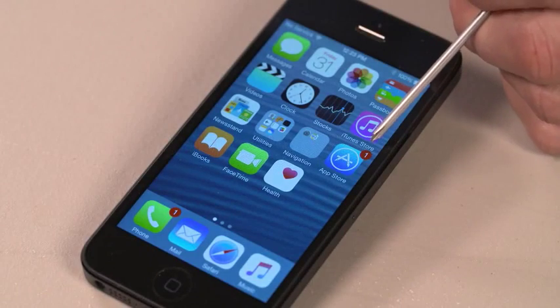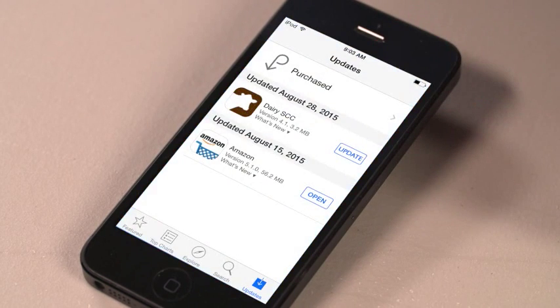To update the app, look for the App Store icon and tap. At the bottom of the screen there is a task bar. On the right side of the task bar, tap Updates. If an update is available for the Dairy SCC app, tap Update.